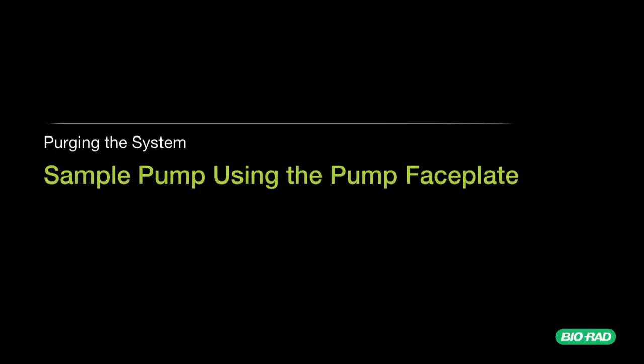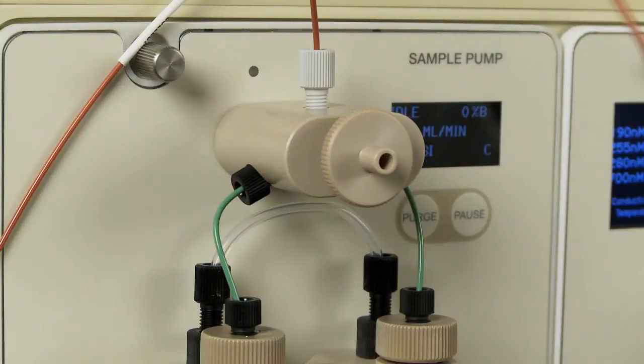Sample pump purging using pump faceplate. You can purge the sample pump using either the hardware faceplate or ChromeLab.